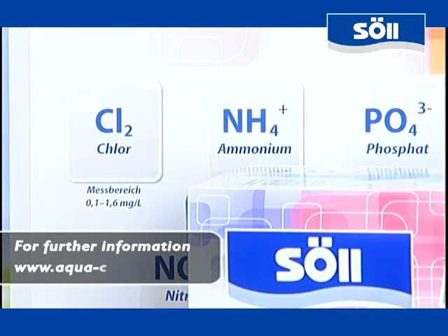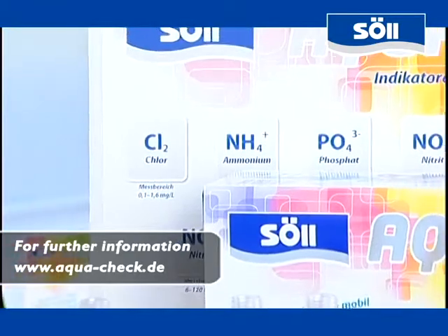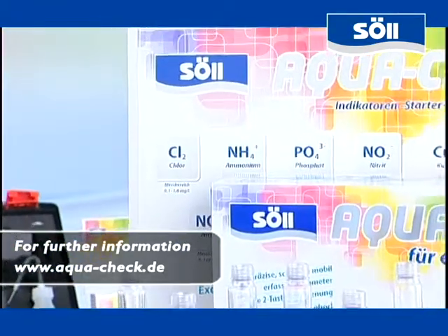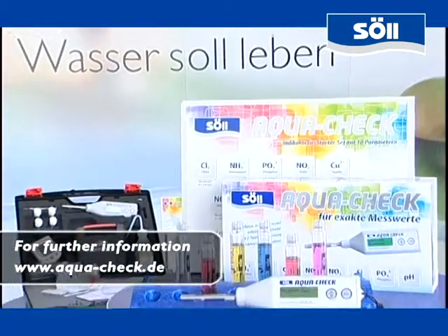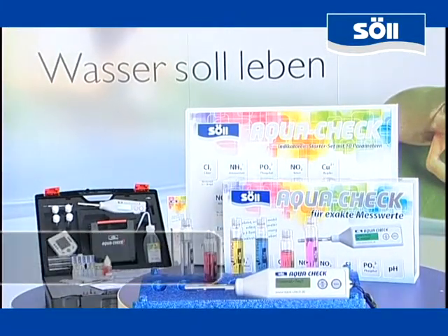As you have seen, water analysis with AquaCheck is not only precise, but very easy, because a 2K operation facilitates an intuitive handling of the photometer. With AquaCheck by Sol, you can make your water transparent.